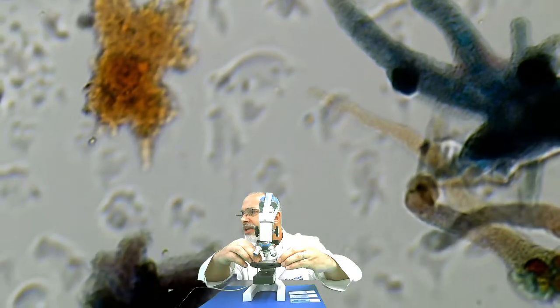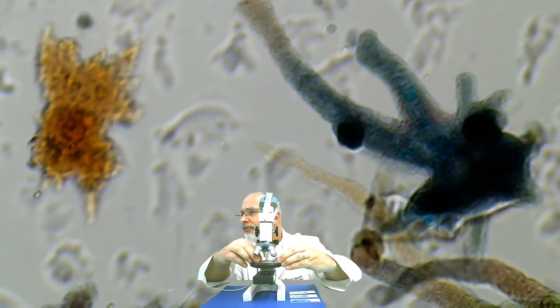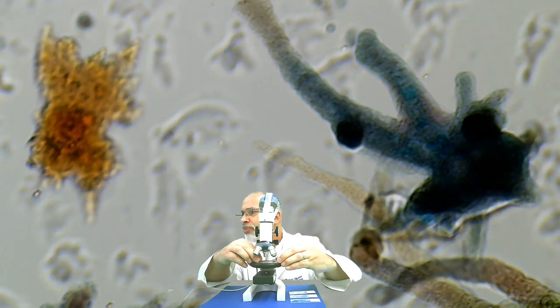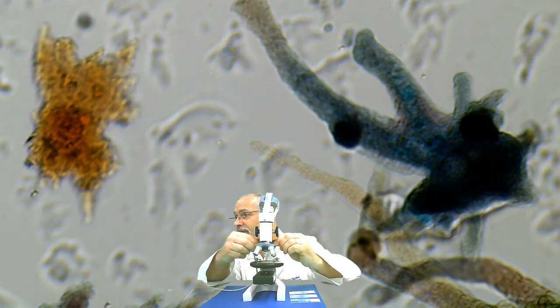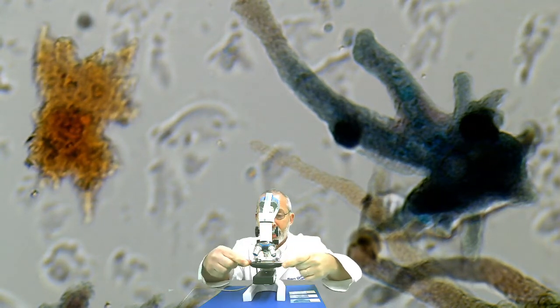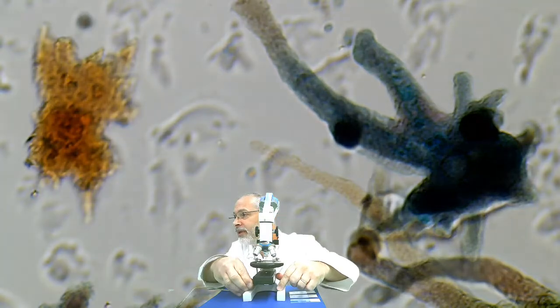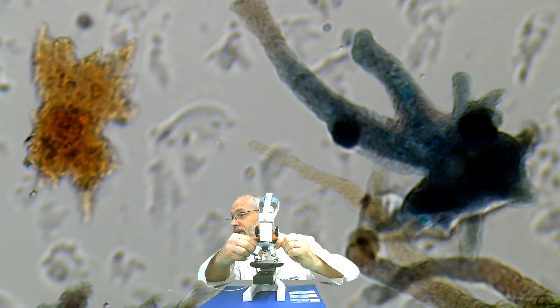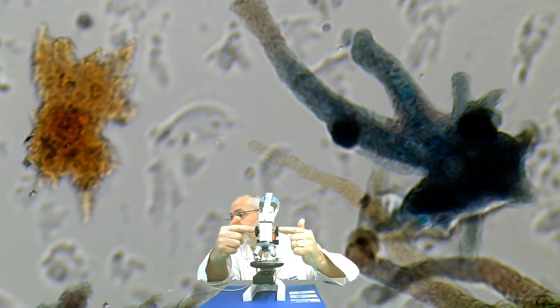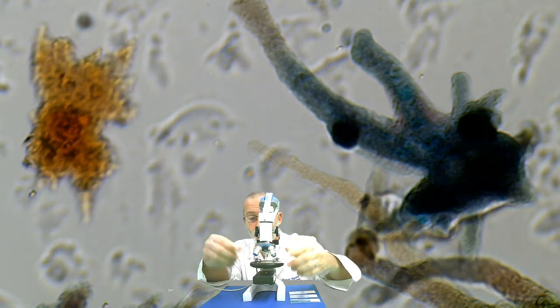I'm basically hunting around right now for various specimens on the slide, and that involves moving the slide around, in my case moving the whole stage around, adjusting the lighting so that we can see them, and using the coarse adjustment knob first and then the fine adjustment knob to fine tune it.